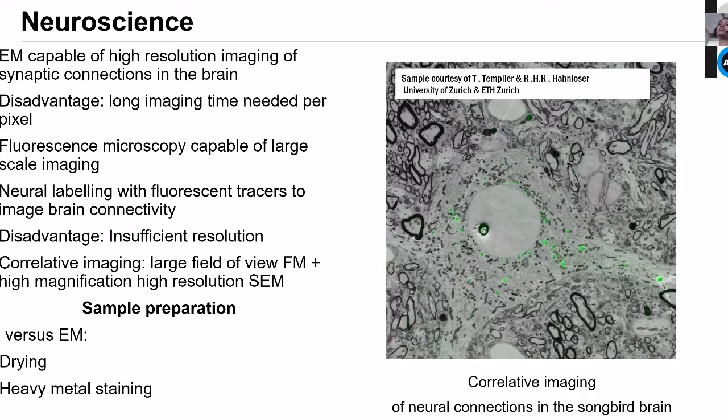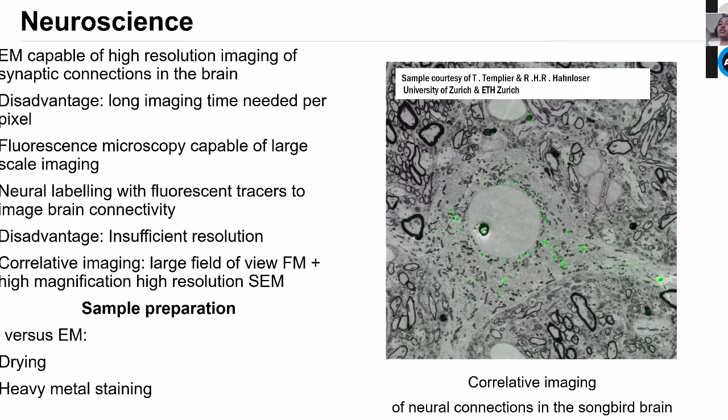A couple of important points here, issues that come up in fluorescence microscopy versus electron microscopy. And it's relevant here because we are doing the two simultaneously. Fluorescence microscopy often requires water to be present in the system in order for the molecules to retain their fluorescence action. But electron microscopy, because it requires vacuum, needs samples to be dry.